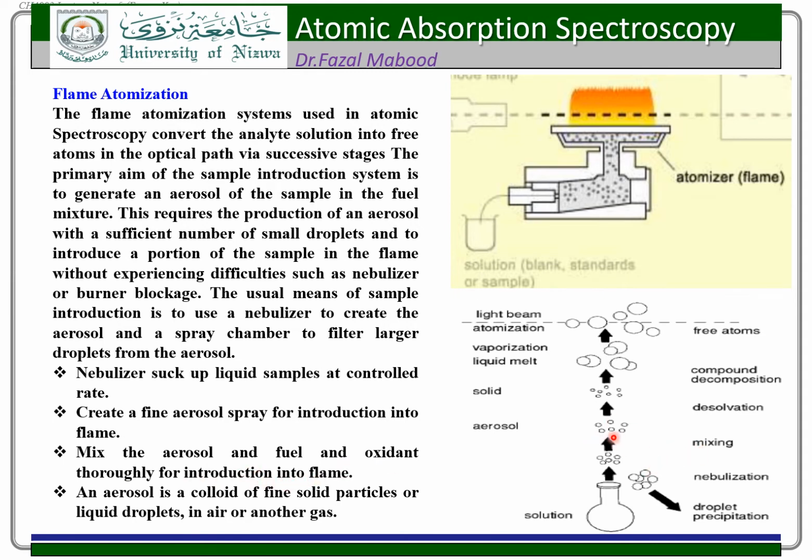Here you see the mixing of the fuel and the droplets. After that there is vaporization and desolvation: remove the solvent, and then vaporize the sample. After vaporization there is atomization, because it has to break the molecule and convert it into atomic form, free atoms. So that is called atomization.